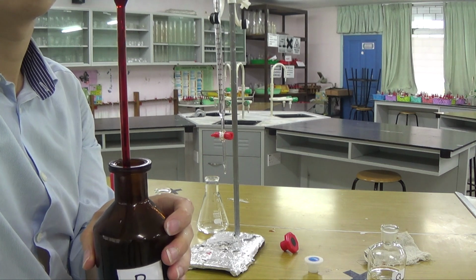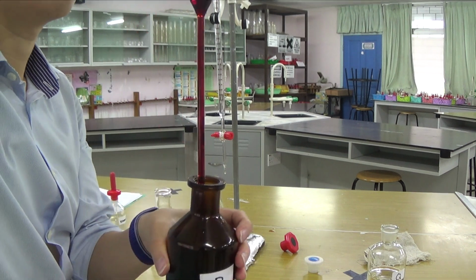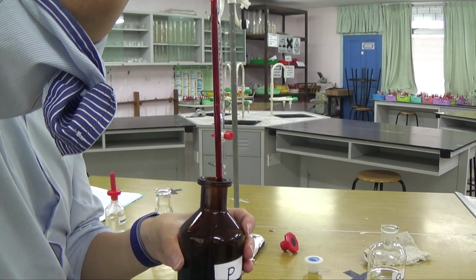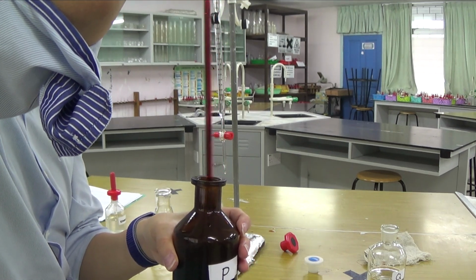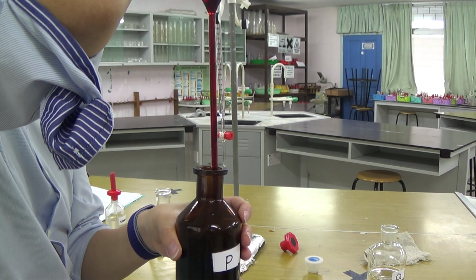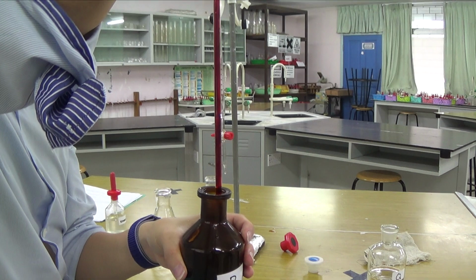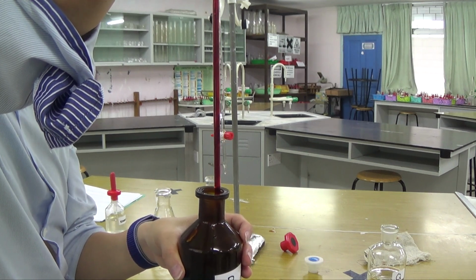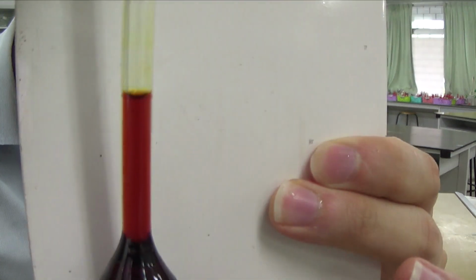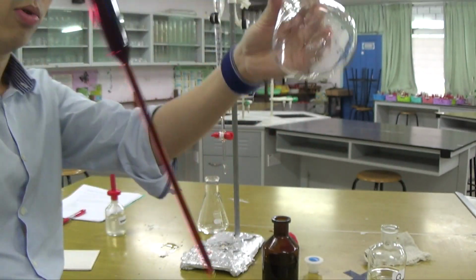Oh no. I will say that is alright. Nope, that's not alright. But this one is a bit annoying because it keeps giving me some air bubbles. Okay, so there's 25 cm cube there, just below the meniscus. Hope that convinced you. I've got a bit of water left in there, but it's okay.